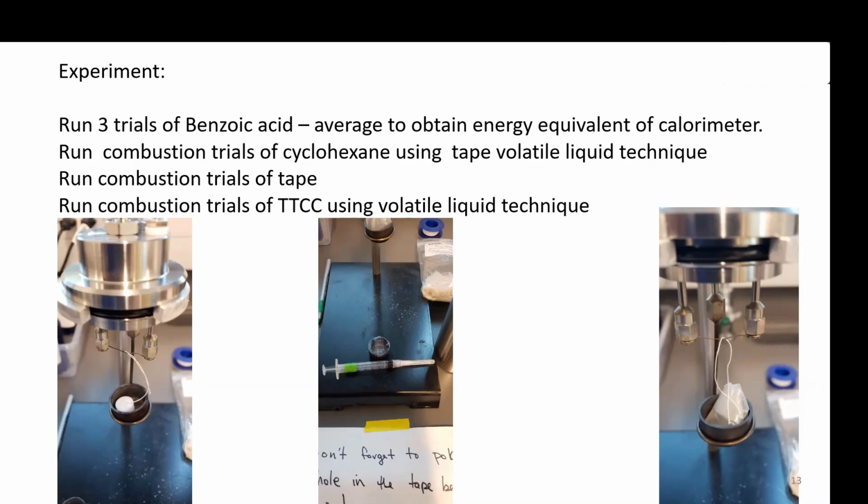So we need to make a correction for the tape. It's difficult to calculate the heat of combustion of the tape if we just use very little tape, right? So we will run another tape correction measurement. In this case, you can see we use a lot of tape together. We measure the weight of the tape and run it 3 times inside a bomb.